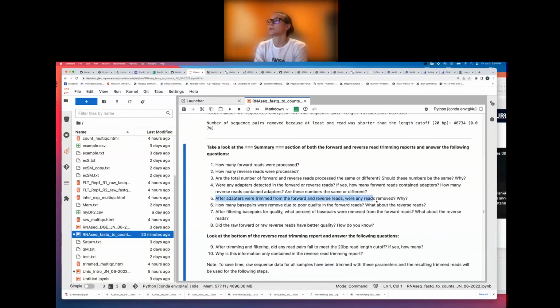After adapters were trimmed from the forward reads, were any reads removed? So I don't think in the interest of time, and because we kind of really dove into this, I don't think we need to do the questionnaire. So maybe we could skip over this question, Armin.